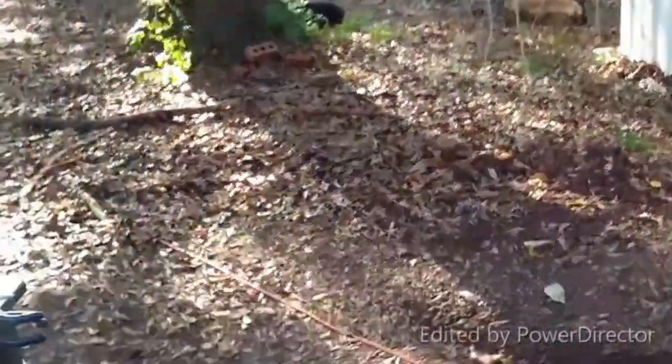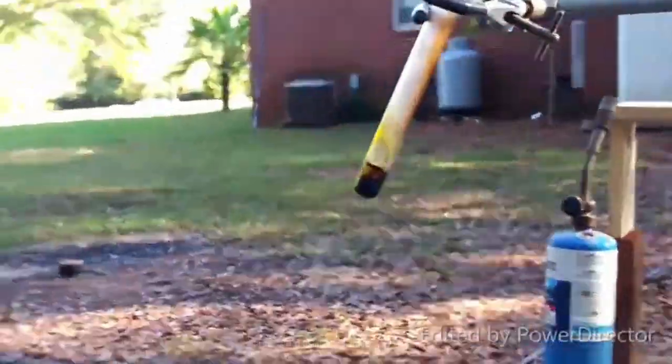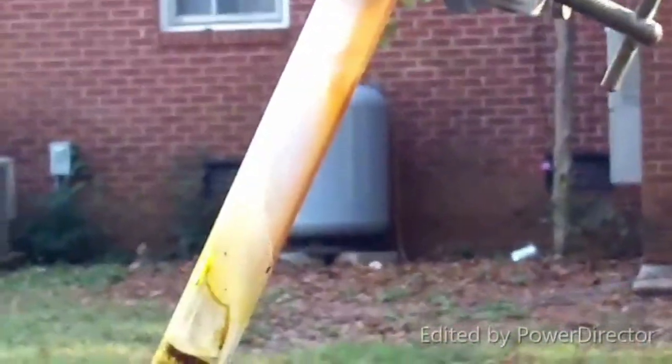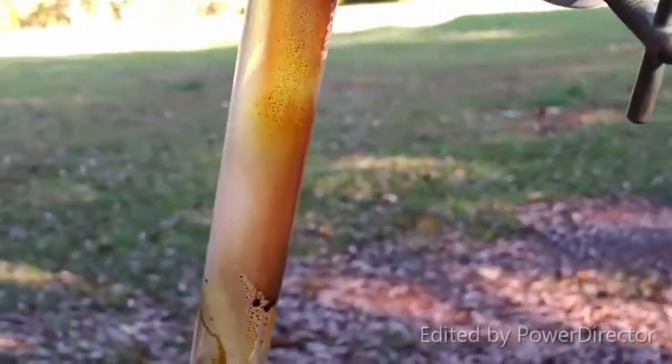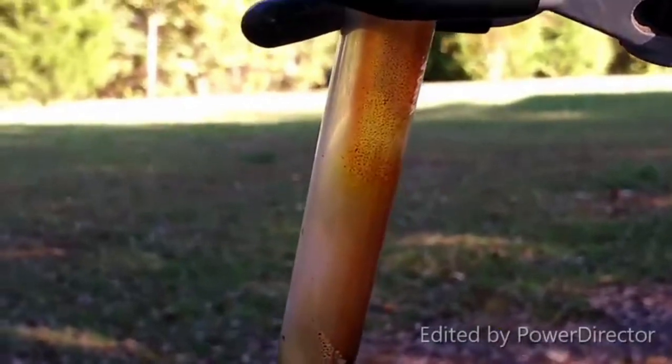Indium triiodide will form a yellow solid and it melts to form a red liquid. Something is condensing and running back down in there. A red solid condensed in the tube — yes! That's it, I'm pretty damn sure it is.